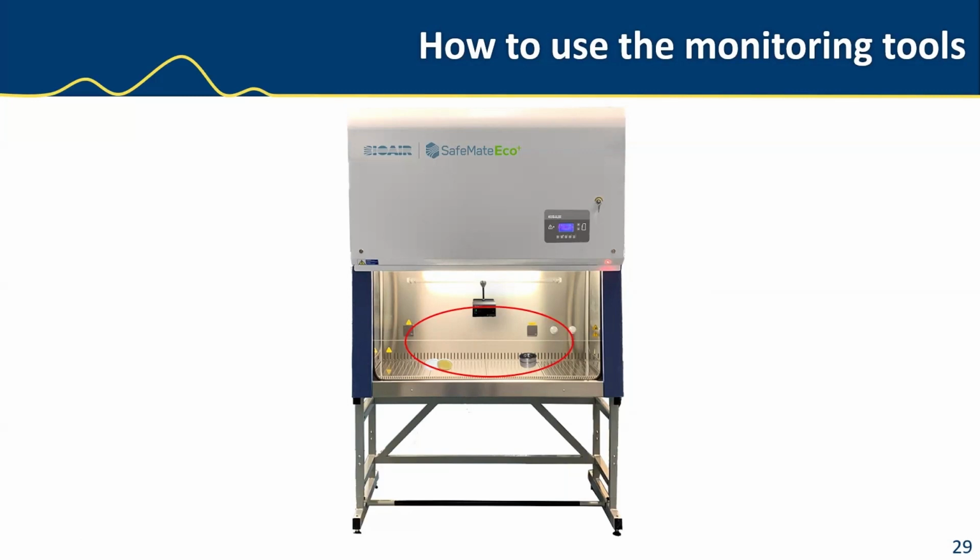You see you have the critical zone here where the operator will conduct their aseptic processing techniques. They could be making the aseptic connections, or they can be doing all sorts of activity that requires that environment to be monitored for sterility and to ensure that the operator is not transmitting any contamination.